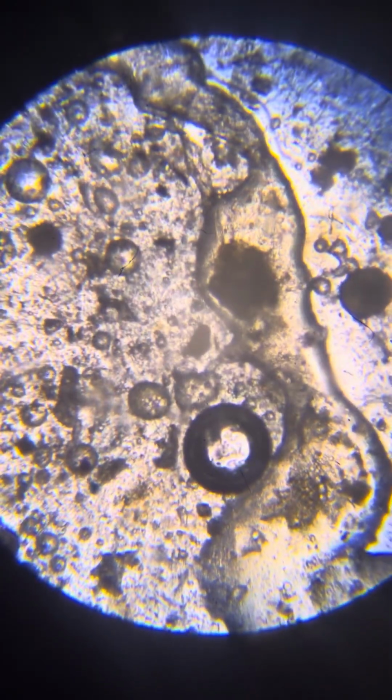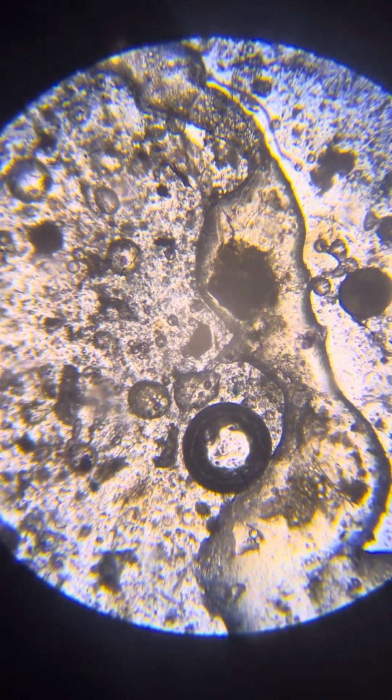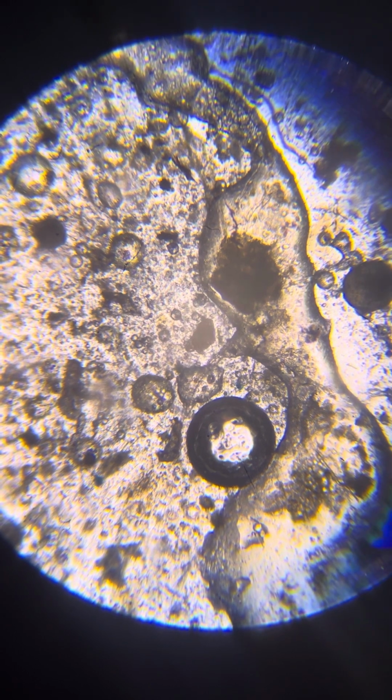This one is pretty. It's a 64 magnification. So this one, I would say it's a big one, but not a huge one. Certainly not of the enterprise class. But it's very lovely, and I really like that you see the white ring inside the black one, the main ring.